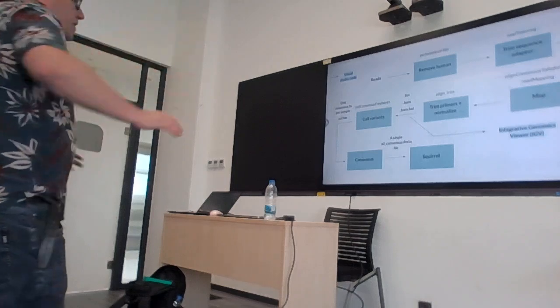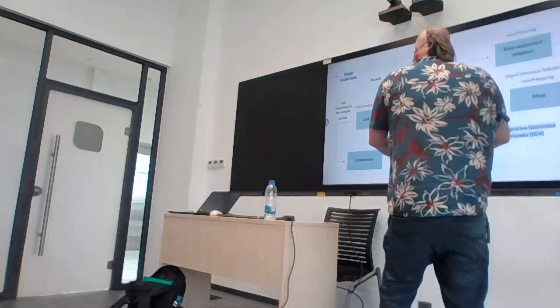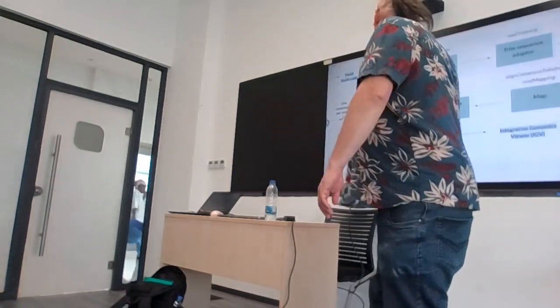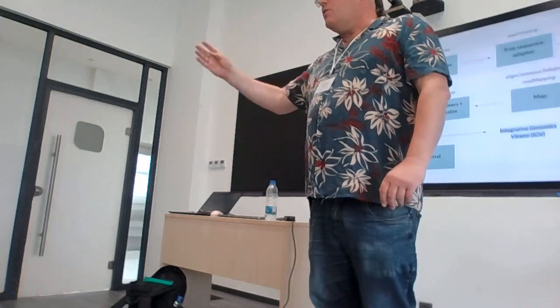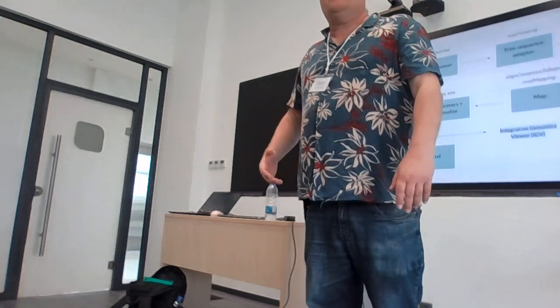Okay. And just to finish off, because I'm in the way of Stanislas and coffee and all the things like that, we looked at the consensus, which is the FASTA. That's the final result. We went back to understand the VCF that lists the variants. And then we looked at the BAM file, which gives us the evidence for the variants. So now we can go back and understand our results. We can see the data that supports our results, using IGV or VS Code to look at the VCF, and then using Nextclade to look at the consensus.